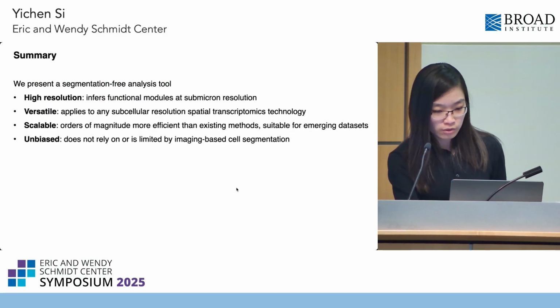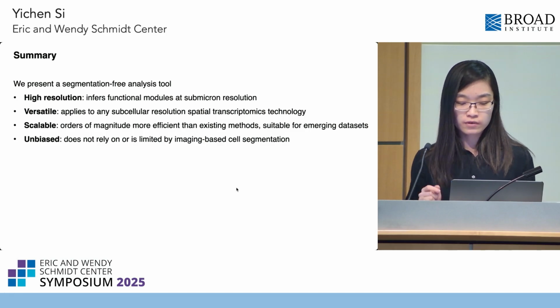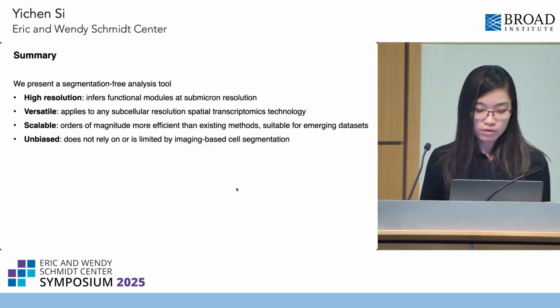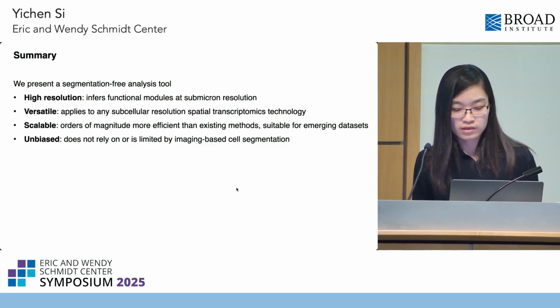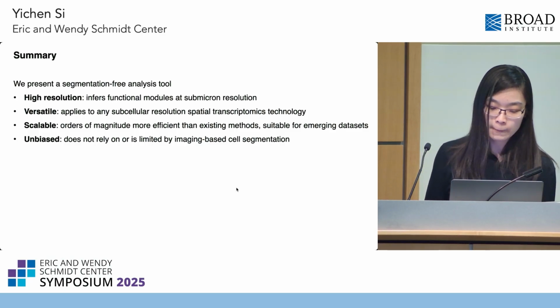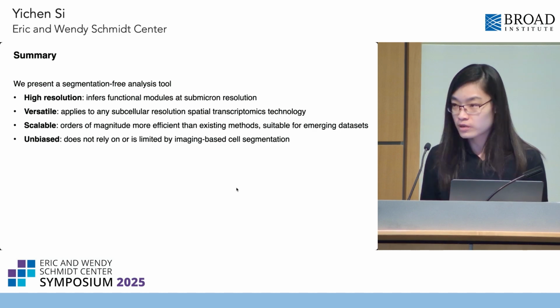So in summary, we present a segmentation-free analysis tool that infers cellular function at submicron resolution. It applies to data from any subcellular-level platform. It's orders of magnitude more efficient than existing methods, and is built for future large-scale multi-sample datasets. And it does not rely on or get limited by imaging-based cell segmentation.